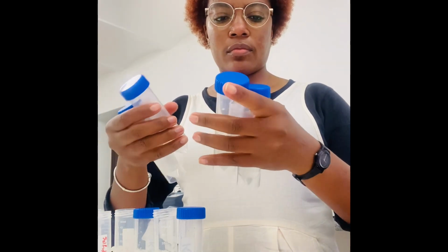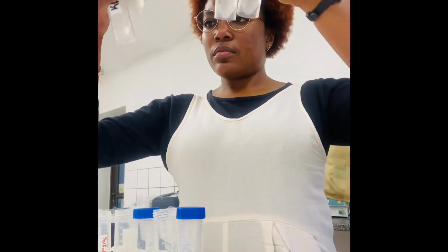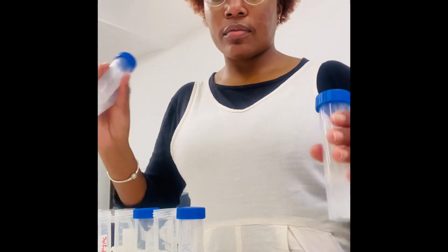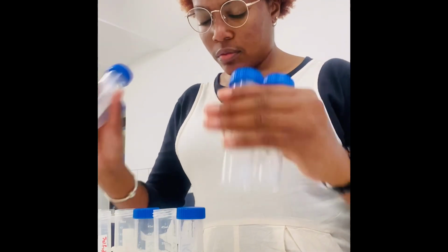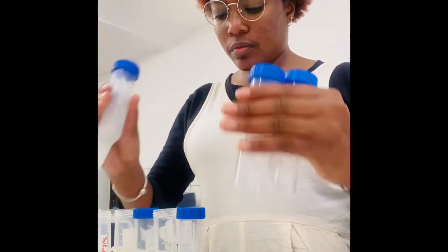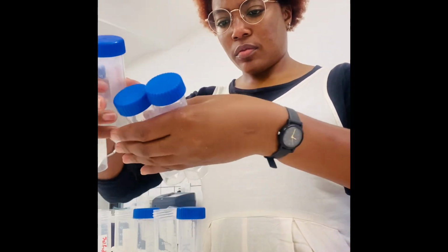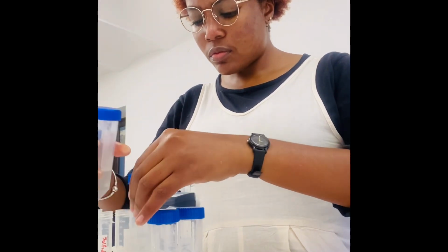So they are also very necessary for the organisms in the water. And for us, we basically want to know what type of nutrients and their occurrences and their values, how much of that we have, or what type we have, what occurs the highest. And most of the time our nutrients would tell us as well whenever we have a bloom of phytoplankton.